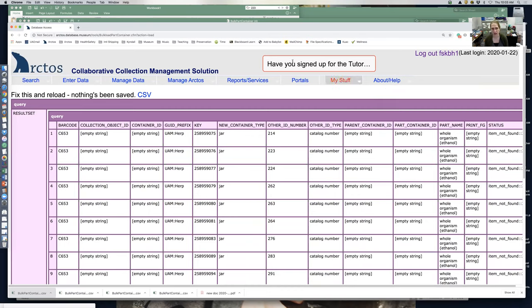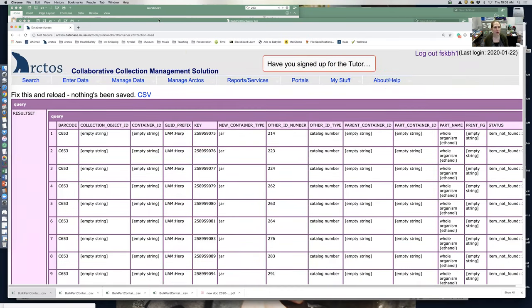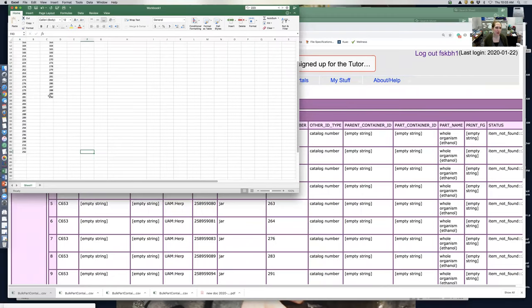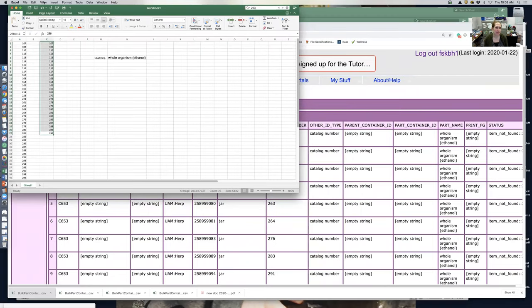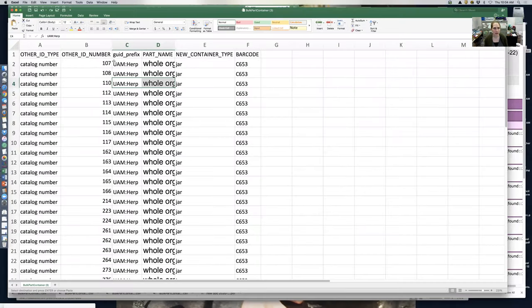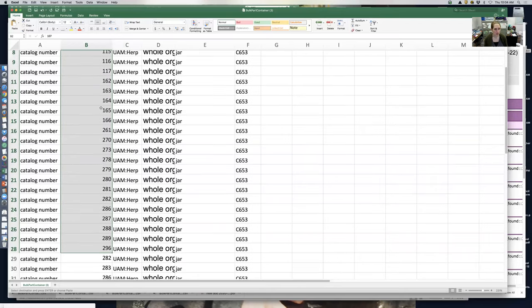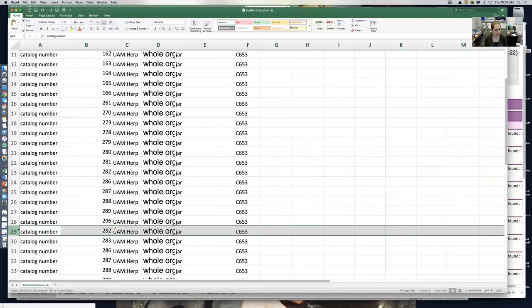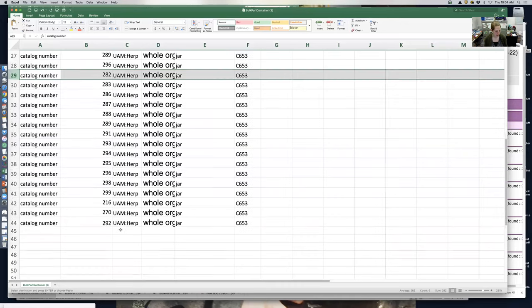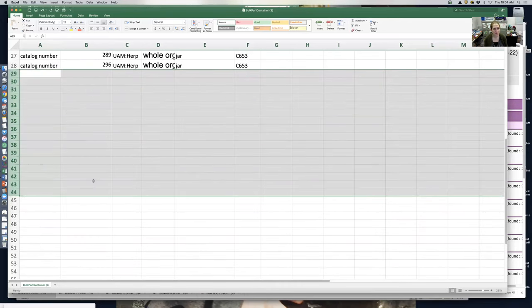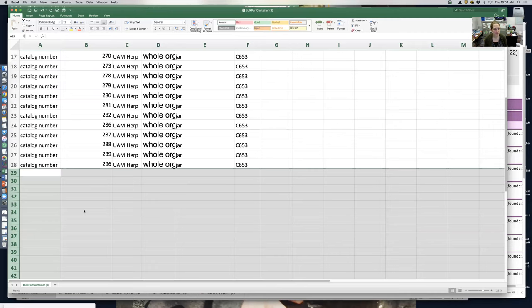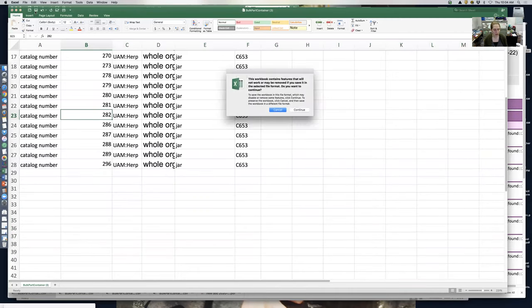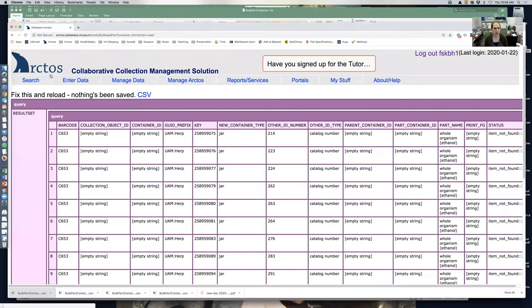So I went back and have an updated version with ones that don't have loans. Go here, paste that here, and then delete all these extras. We'll save it again and continue.